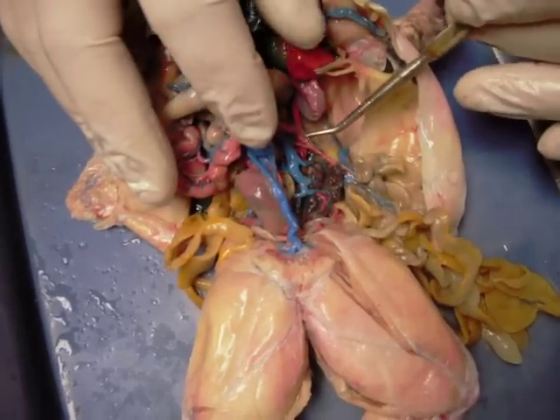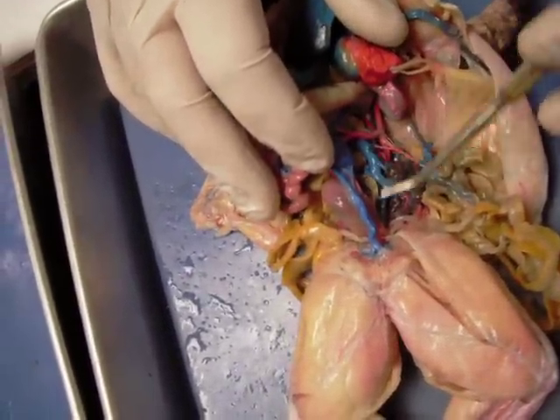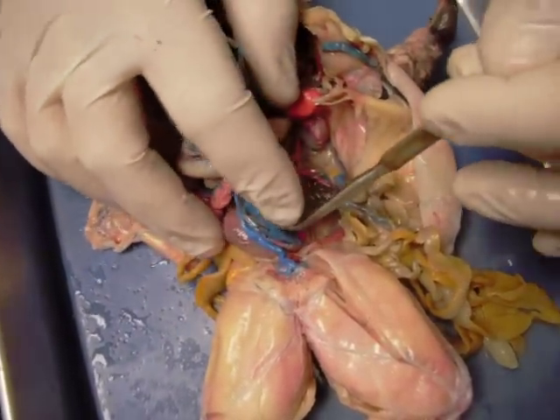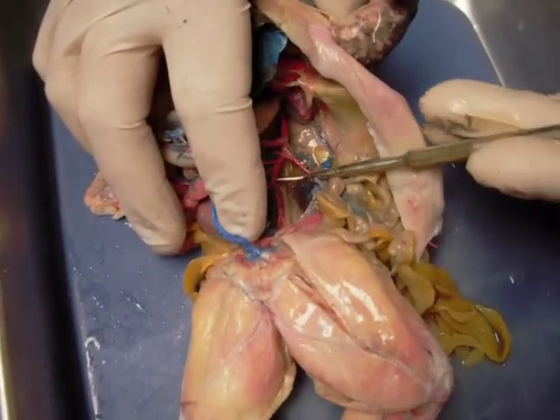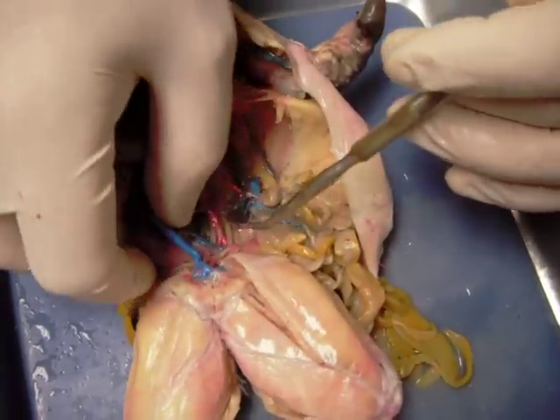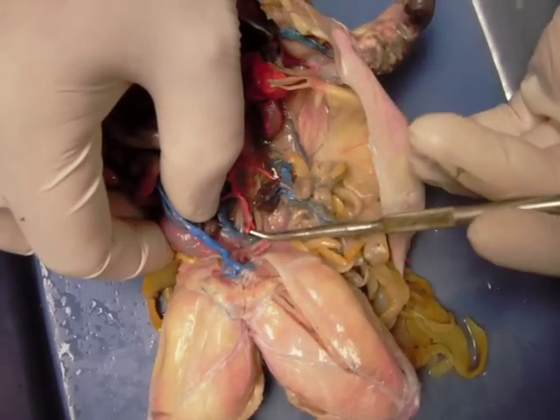Other structures include the kidney right here — it's a little misshapen — and we have the posterior vena cava, and then the ventral abdominal vein. We have the dorsal aorta and the urogenital arteries. If we follow the dorsal aorta posteriorly, it branches into two pieces — you can see a left and a right piece here — and these are the common iliac arteries.